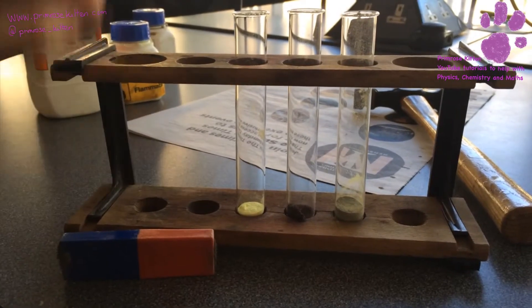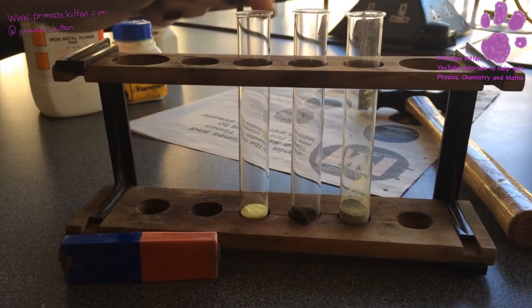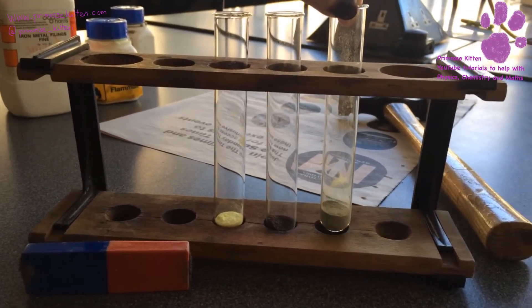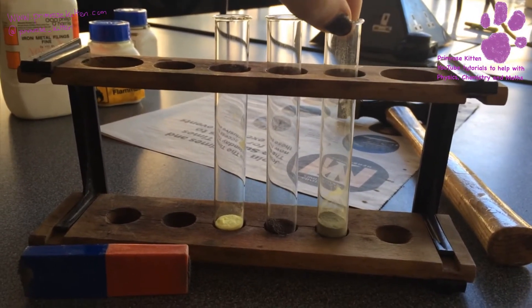So here we have some sulfur. You can see that it is yellow. Here we have some iron filings — they are a brown color. And this is a mixture of sulfur and iron. It's kind of a dark yellow color.